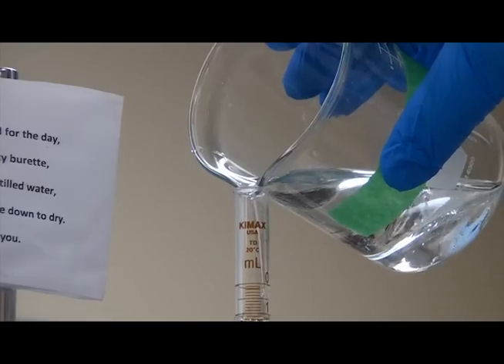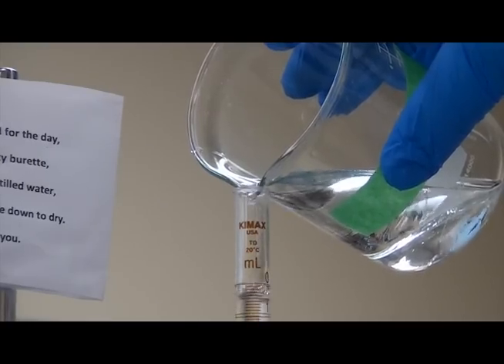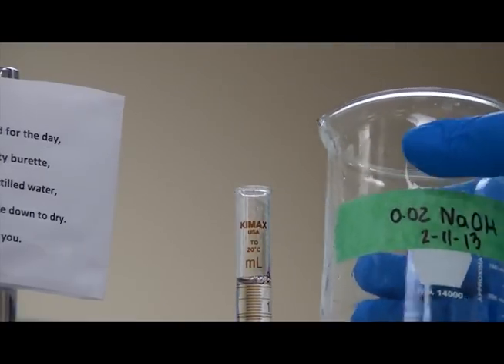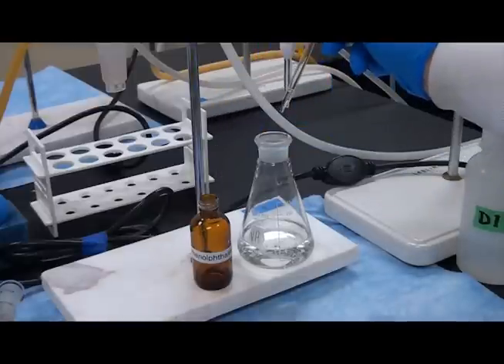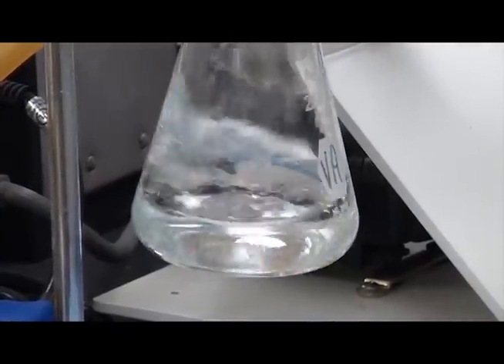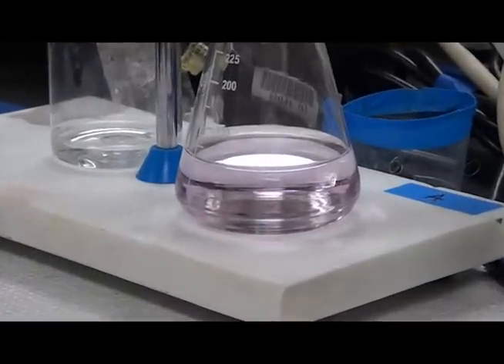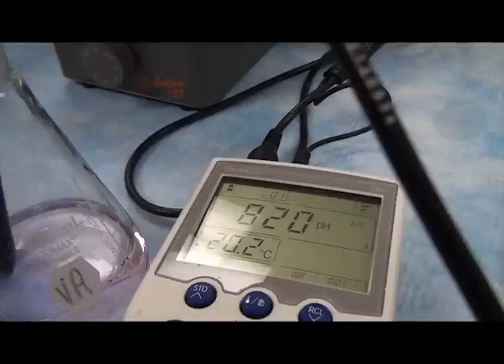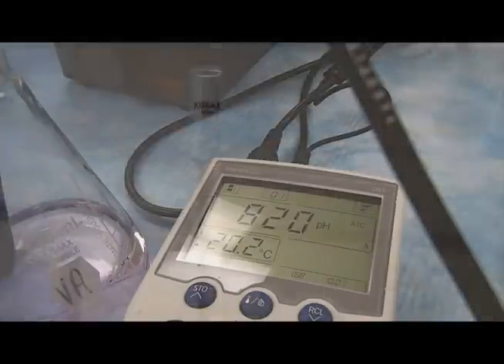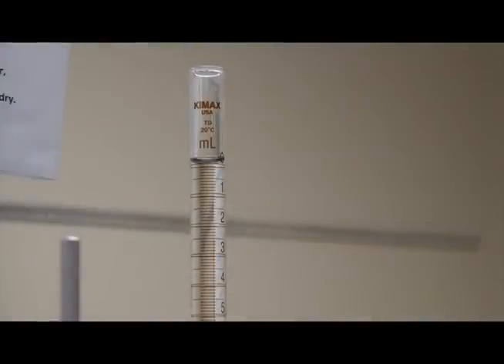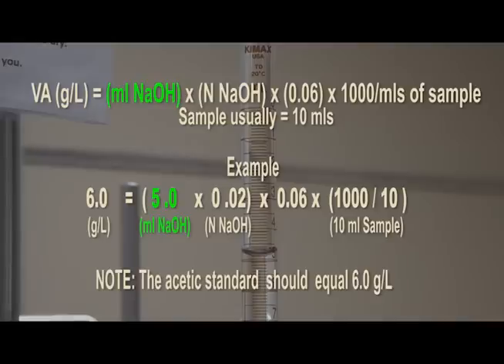Titrate the sample or standard using a 0.02 normalized sodium hydroxide solution. Add three to five drops of phenolphthalein, and the titration endpoint is a very faint pink. A reference check of pH at room temperature should equal approximately 8.2. Be sure to record the starting and end values on the burette, as this gives you the value for the VA calculation.